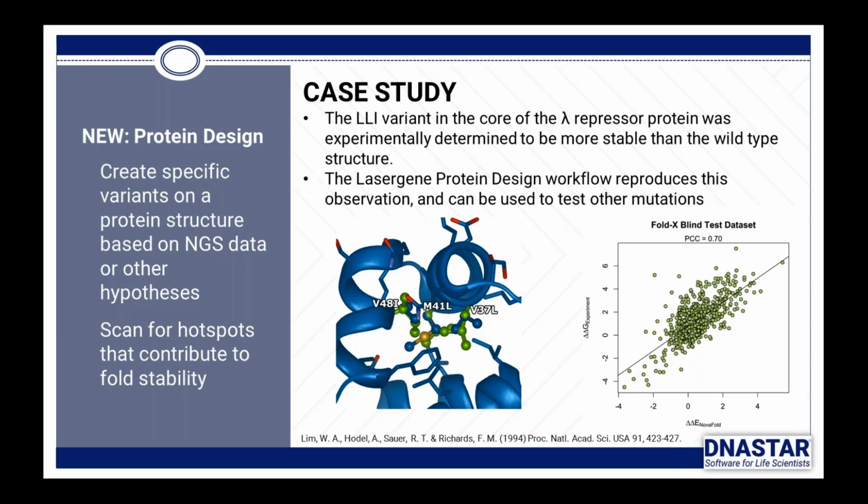What it allows us to do is a couple of things. It can scan through regions of amino acids. It'll take a structure file, scan and look for what are called hotspots. It does a substitution of alanine across those amino acids, and that scanning can figure out which residues are the most impactful on the stability of that region of the protein in that structure. So you can scan through proteins, find what look like important points, and then go in and create specific variations in that protein and see what the impact is on the structure.